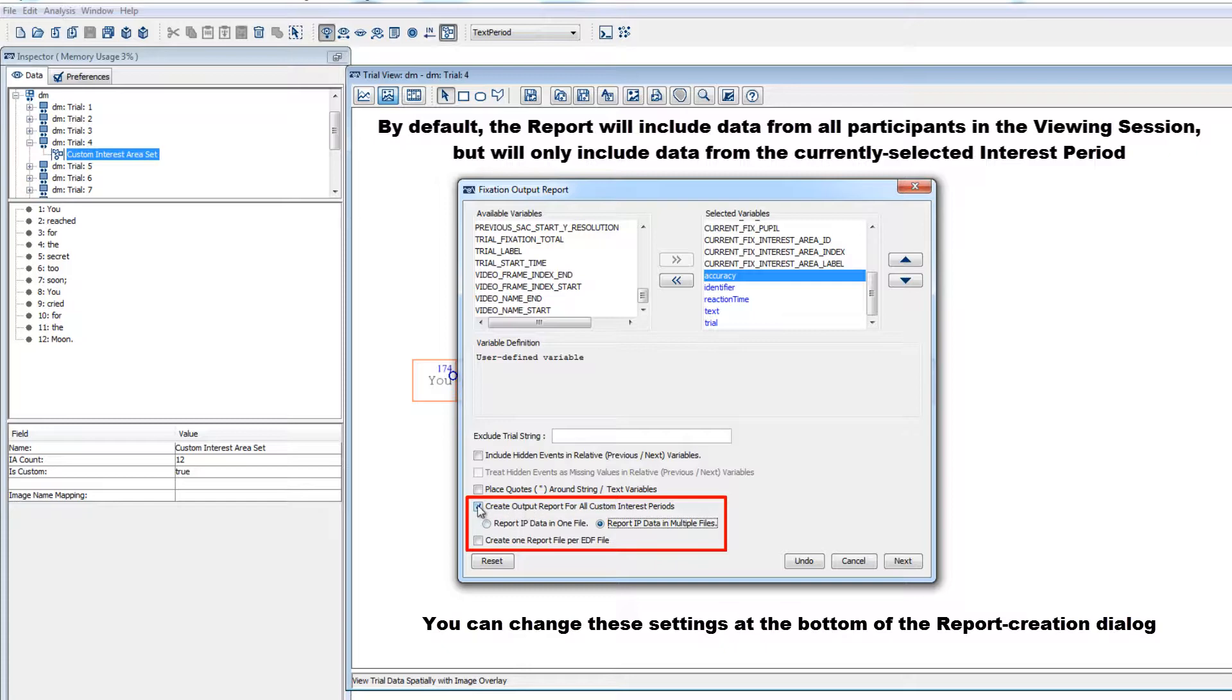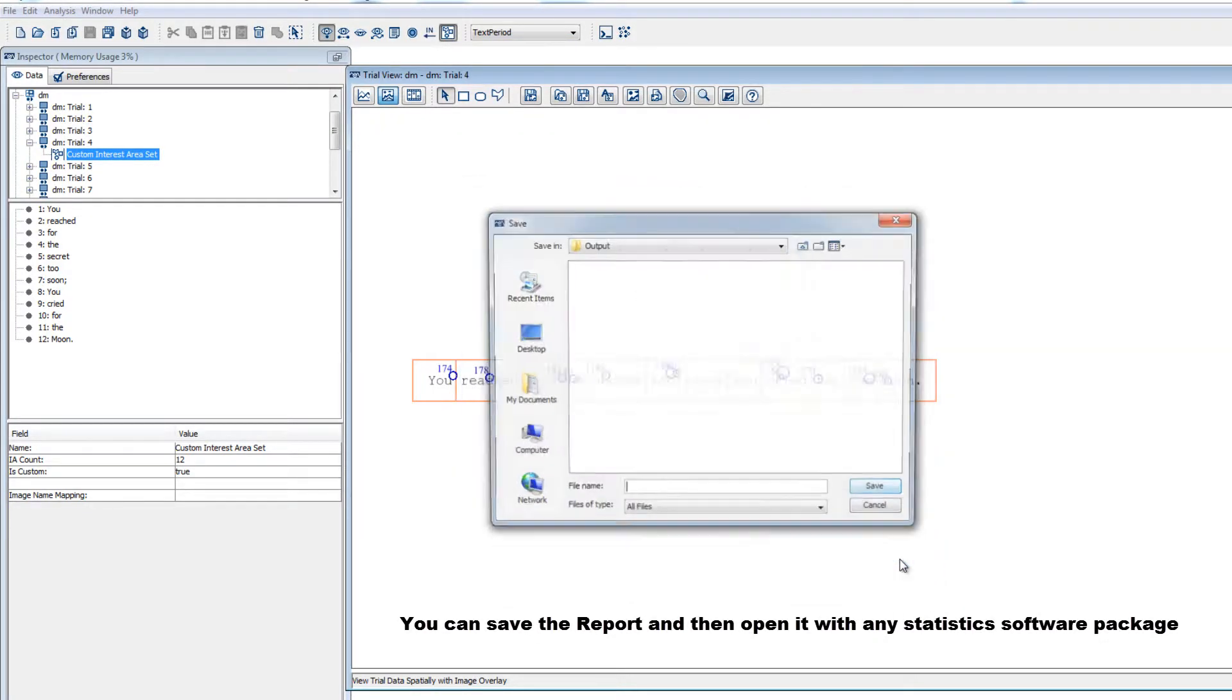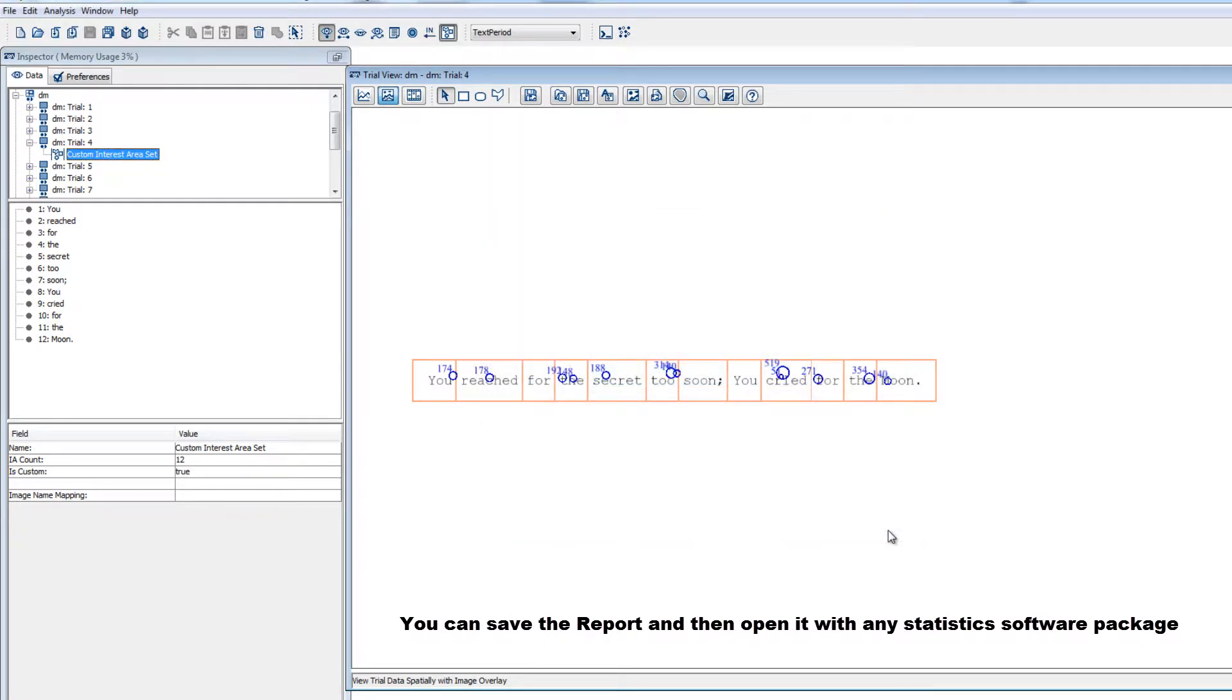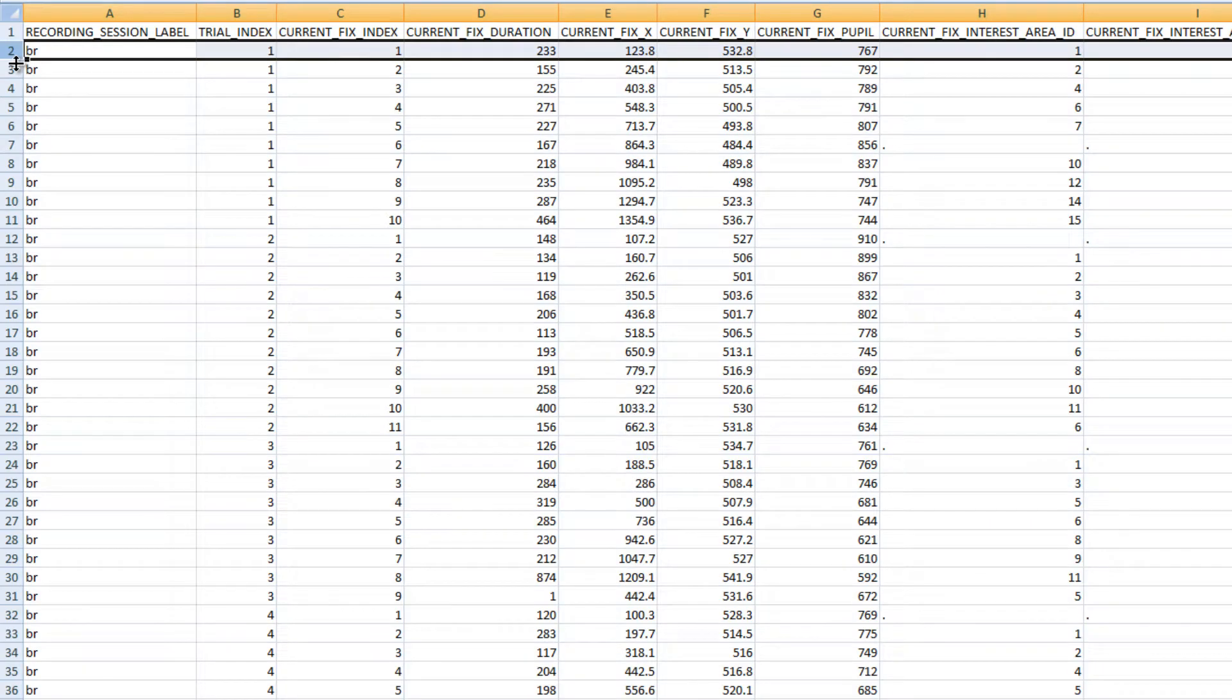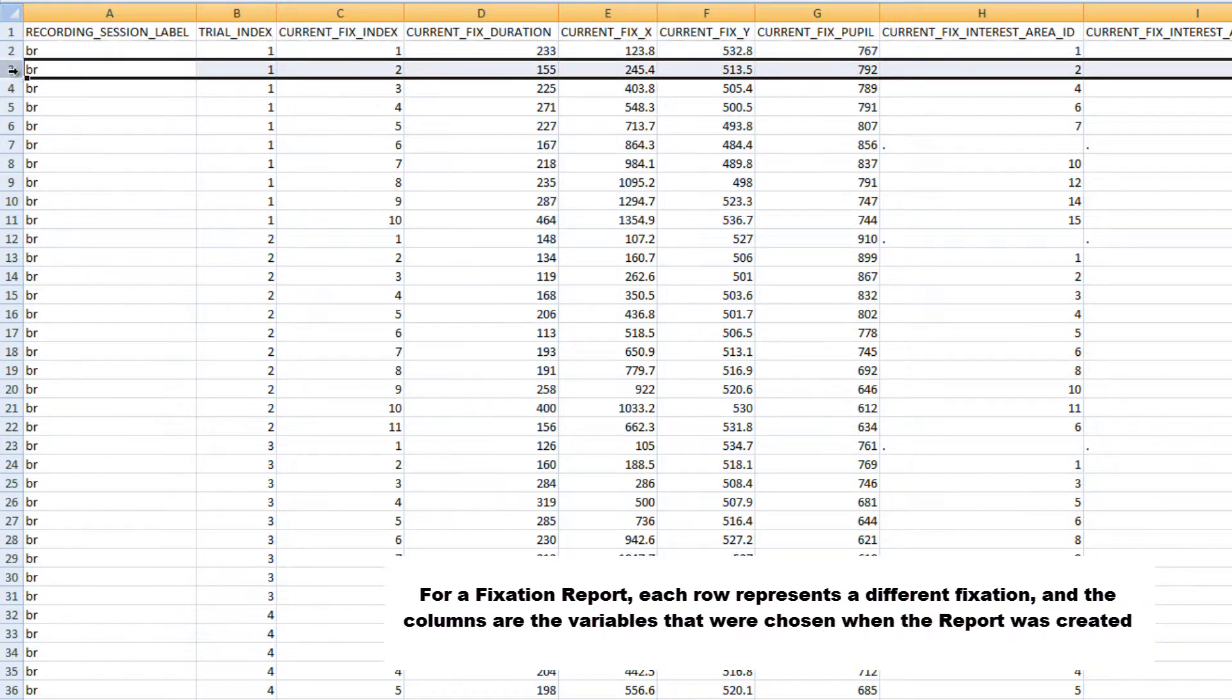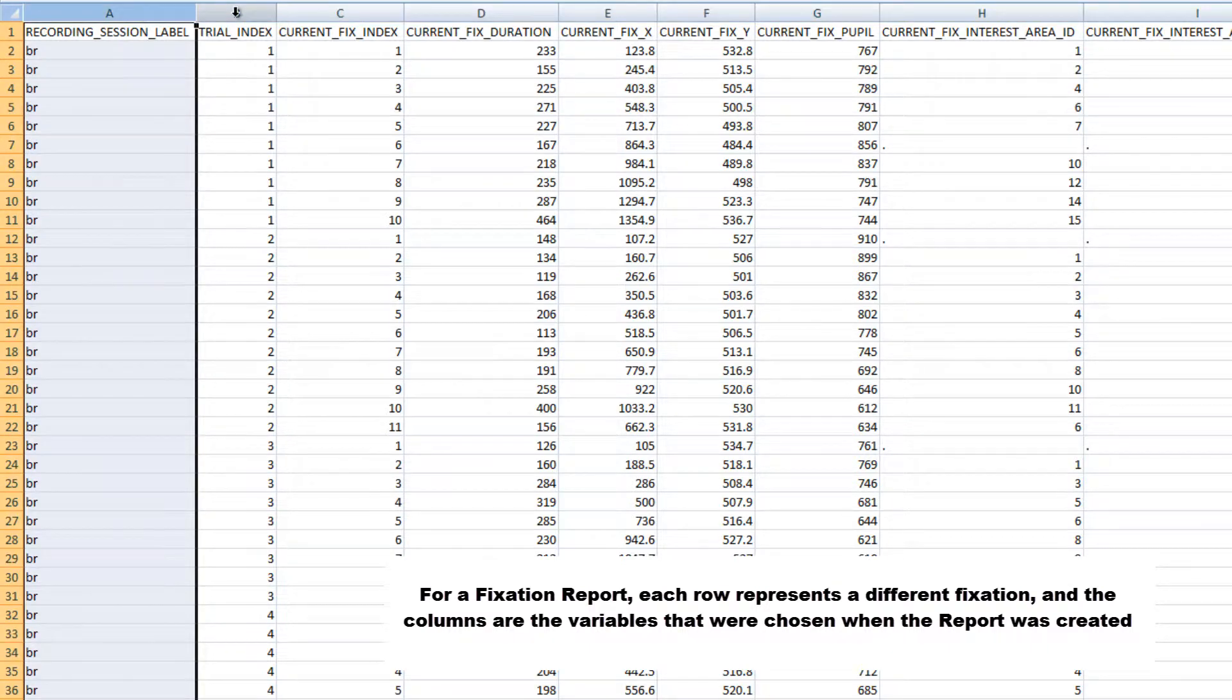After we create the report, we can open it in any statistics package to check the data and perform any inferential statistics on the data. I'll open it in Excel here, just so we can take a quick look. Once it's open, we'll see that each row represents a different fixation, and the columns are the variables that we selected when creating the report.